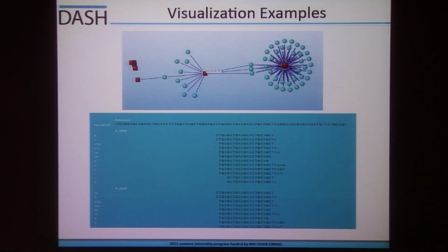These are graphs that I generated using Canvas Express. The first is a network plot for microRNA, and the second is a read length. And so these are very helpful tools that many biologists can use in order to see their data.